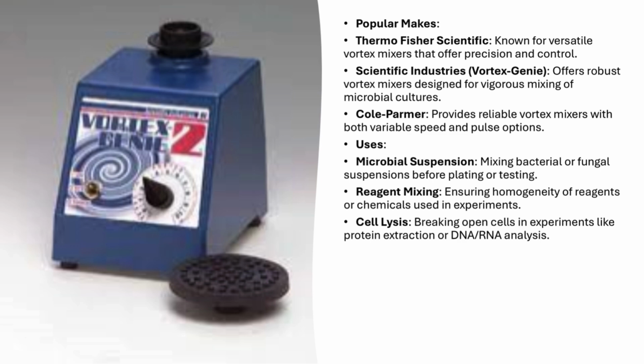Popular makes. When it comes to reliable vortex mixers, brands like Thermo Fisher Scientific, Scientific Industries, Vortex Genie, and Cole-Parmer offer a range of models designed for precision, control, and durability in microbiology labs. Uses of vortex mixers in microbiology. So, what are some of the key applications for vortex mixers in microbiology?